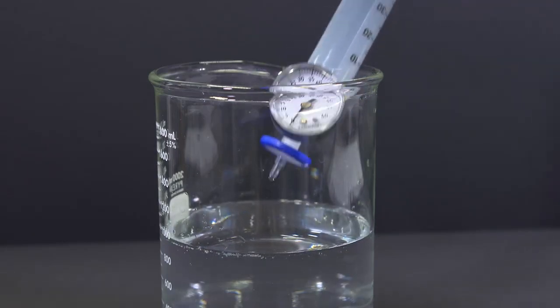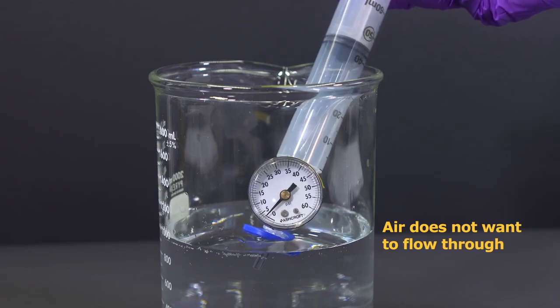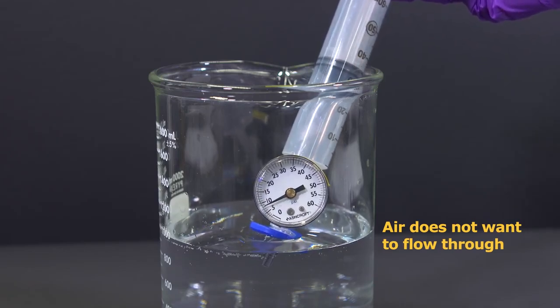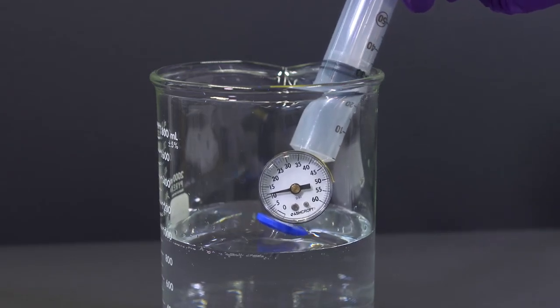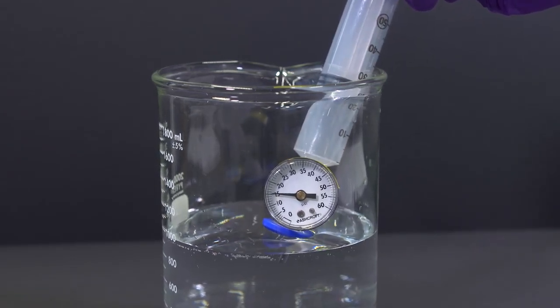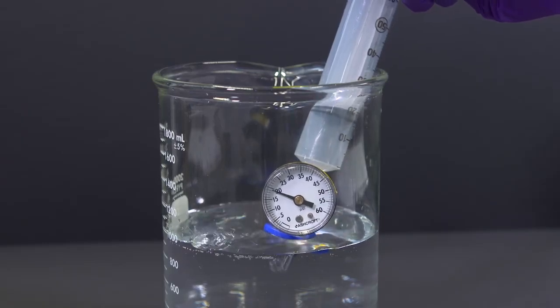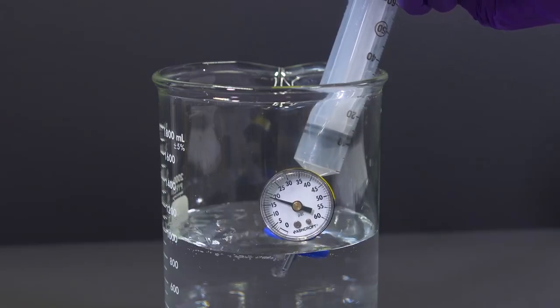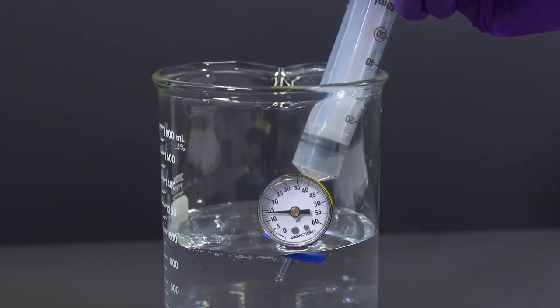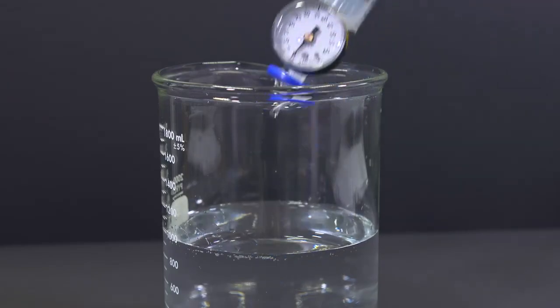Now, when I try to push air through the wet filter, there is a lot of resistance. Air does not want to flow through the wet membrane because water held in the pores by capillary forces is a barrier to gas flow. But if I apply enough pressure, I can exceed the capillary forces, push the water out of the pores, and see air bubbles coming out downstream. The pressure required to initiate airflow through the wet membrane is known as the bubble point.